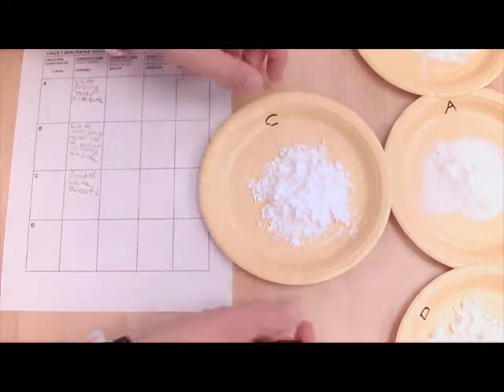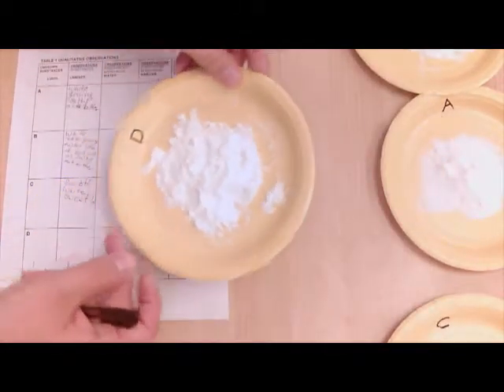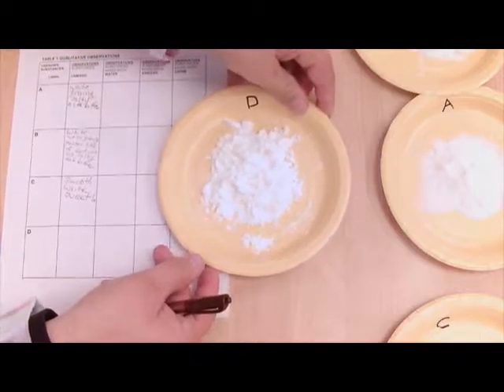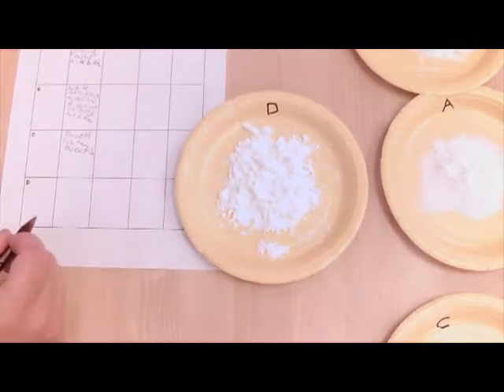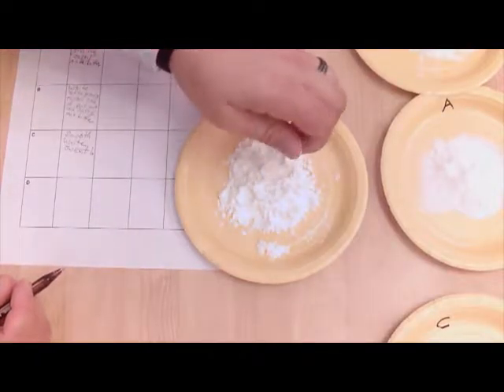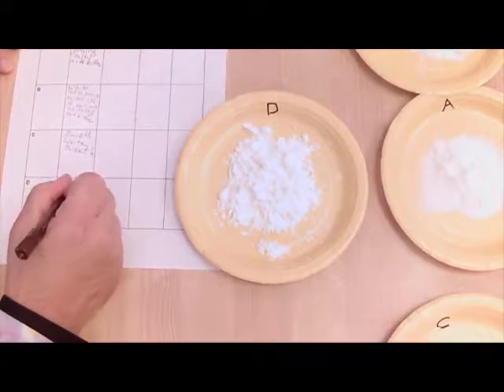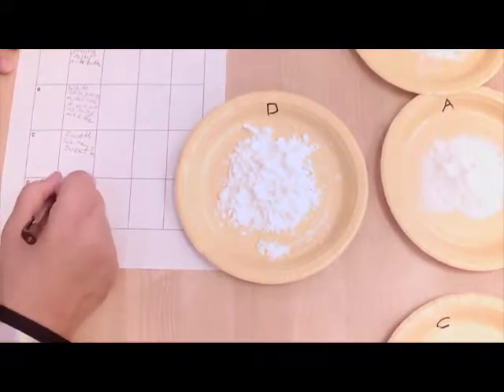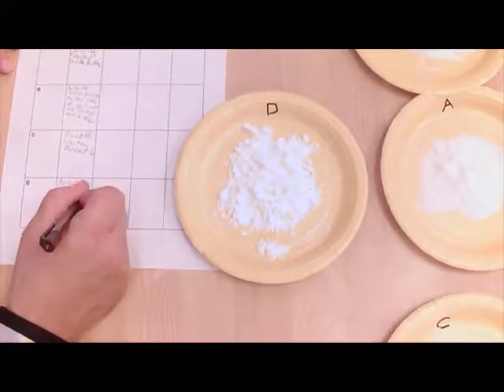Where's D? Here's D. Okay. So D, ooh, it's chalky. Feels chalky, it's white. So all four of them are white. This one is chalky feeling.